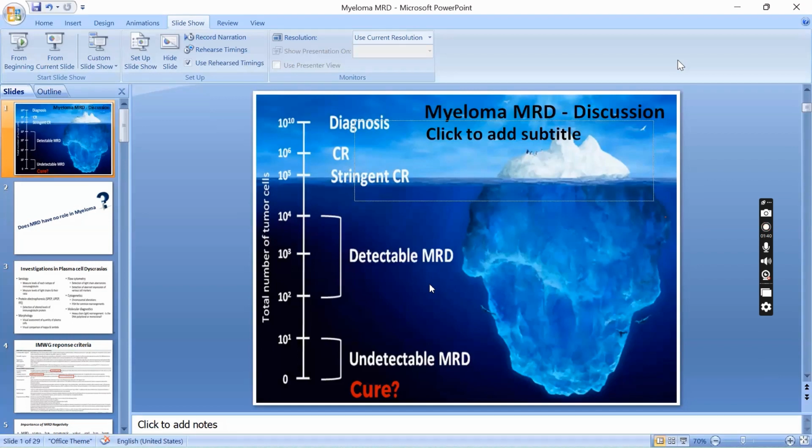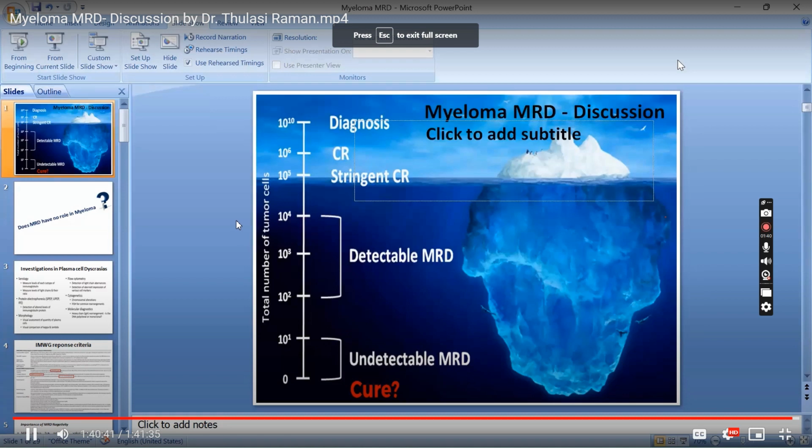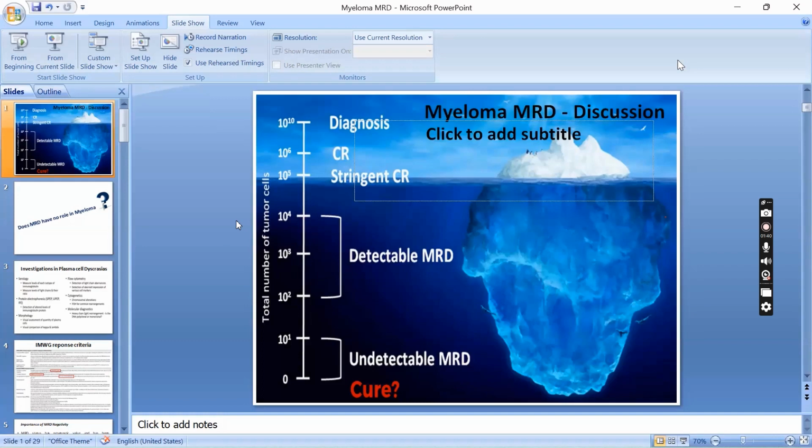If you are a Beckman customer, you can use IO Test lyse, which is an ammonium chloride. Versalyse is a non-fixative lyse, but the method of lysing is by saponin reagent. Optilyse has fixative.